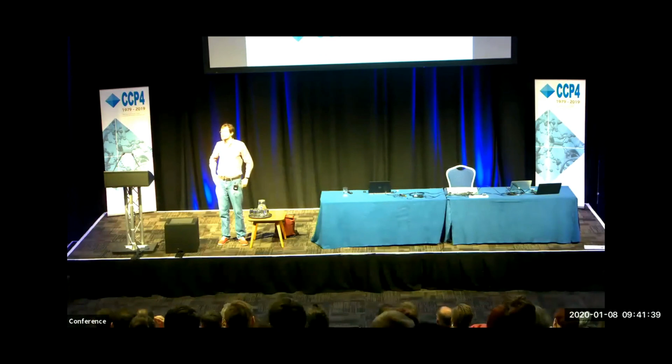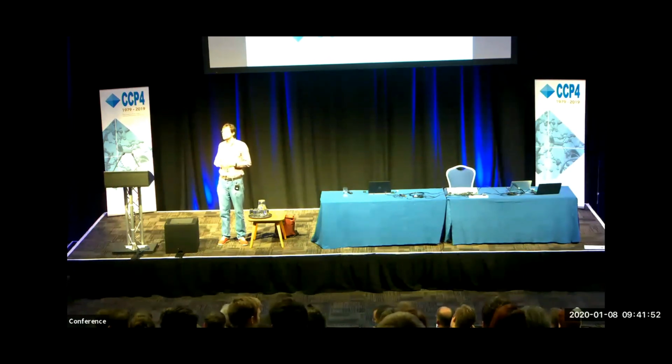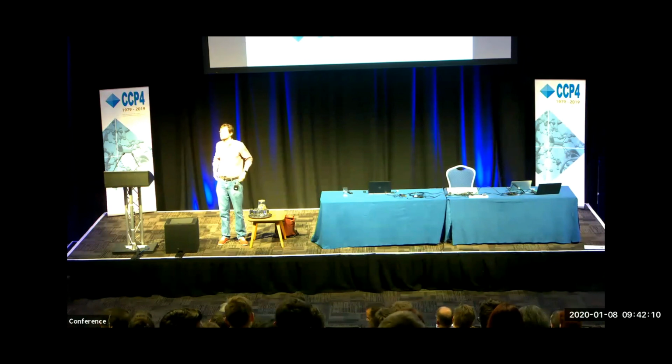It's not doing anything special for split crystals, but it is tending now to join the clusters of spots that were separated before in the old algorithm. The overall effect is that you get larger shoeboxes and it encompasses more of the strong pixels within the shoebox. So with your split crystal you'll still end up with both parts of the split in the box, and the center of gravity of that will be the centroid position for the spot.